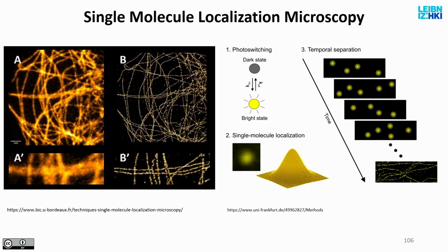But what if I took these little molecules into only flashing light one at a time, or a few at a time? Then two molecules which are very close to each other, either one of them would emit light or the other one would emit light, but almost never both. Then I would see them. But I will see them on different images.